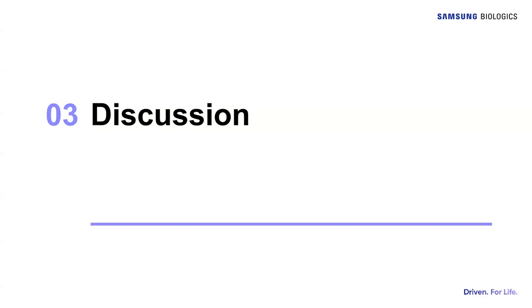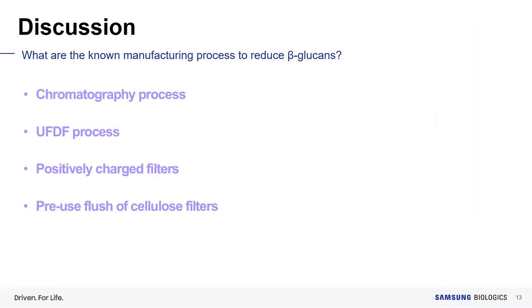It is important to solve unexpected false positive reactions. There are four types of manufacturing processes to reduce beta-glucans. First, chromatography processes — such as ion exchange, hydrophobic interaction, or protein A affinity chromatography — can reduce beta-glucans. Process details such as flow rate, bed height, buffer volume, and conductivity may impact beta-glucan removal. Studies show that bind-and-elute modes are usually effective, while flow-through modes are usually not effective.